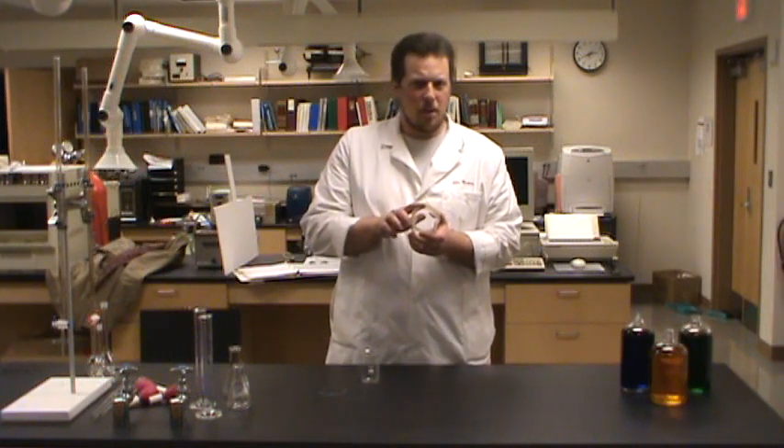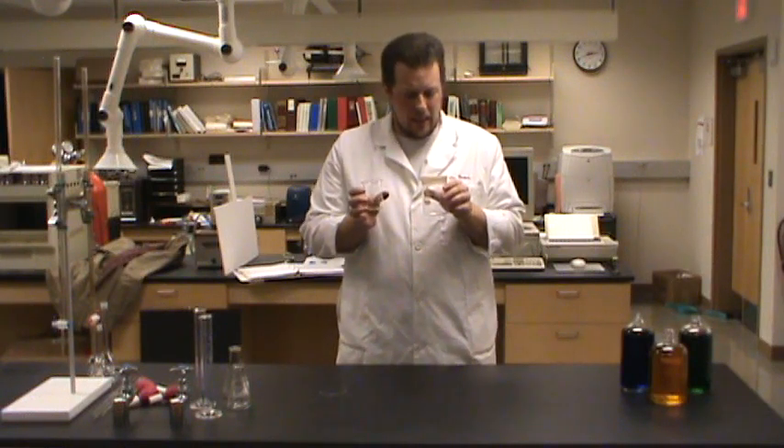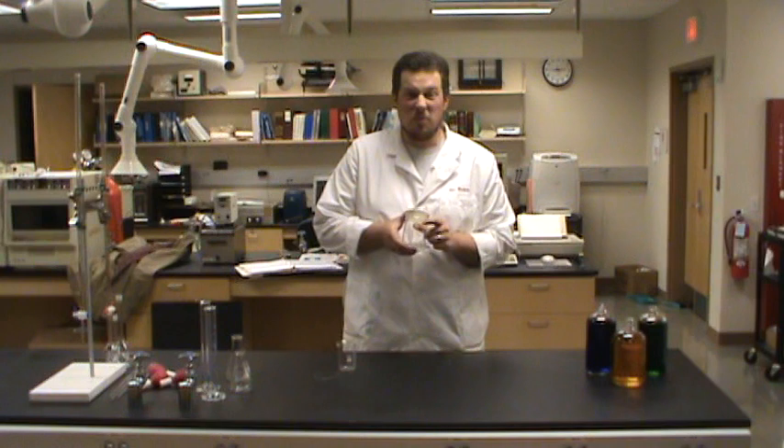A lot of people, if you look at the side of the beaker, will use beakers as a way to measure amounts of liquid. That's usually not a really good use of a beaker. If we look at this beaker, we can see that it says right on the label that this beaker's graduations are only accurate to about 5%. If we're at a 300 milliliter volume, 5% of 300 milliliters is 300 times 0.05, which would be 15 milliliters. So if I want to measure 300 milliliters accurately, 5% error is quite a bit.